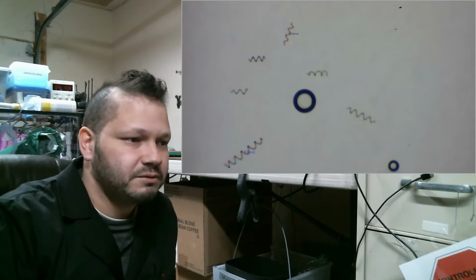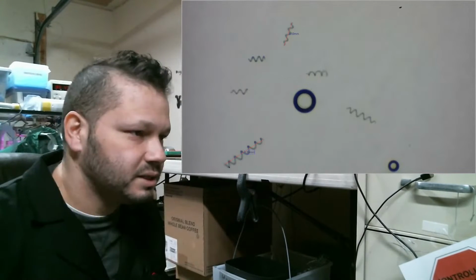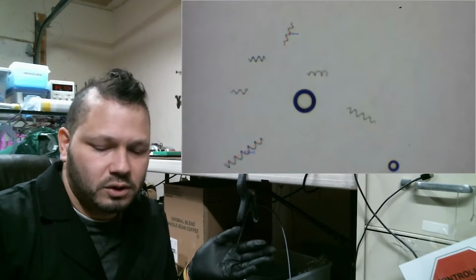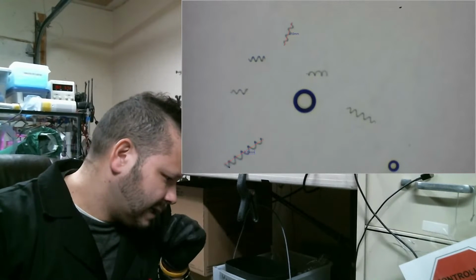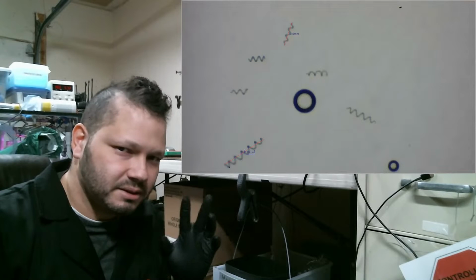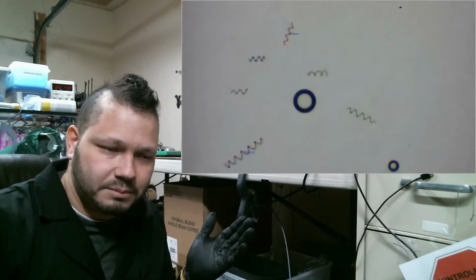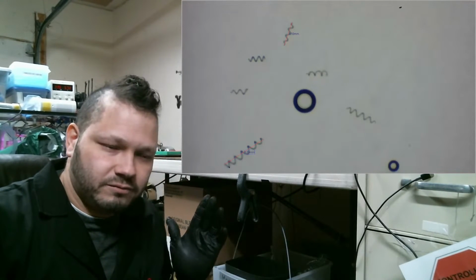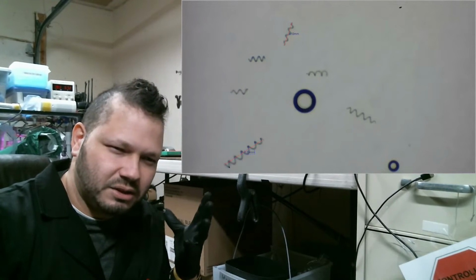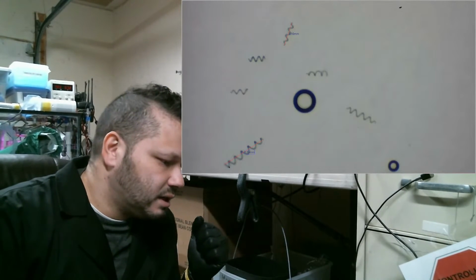Well, that's pretty much it for this video. Unless I do something in between, it's going to be another 3 days before I take another observation and add some more hormones. And I'm going to keep the indole acetic acid thing going until I can really tell whether the culture has completely collapsed and died. For right now, I don't know if maybe there's enough cells there to maybe regenerate. But who knows?